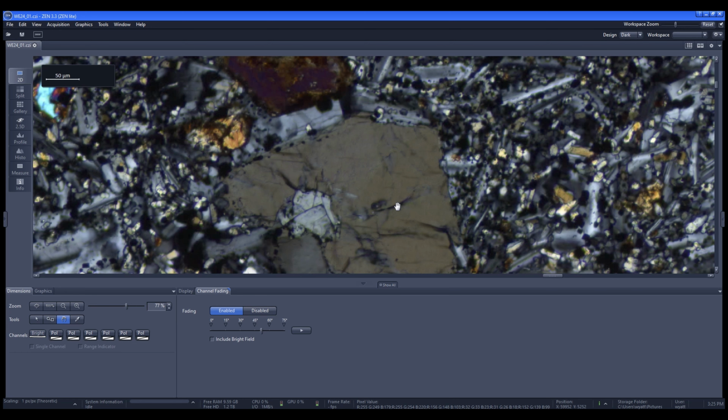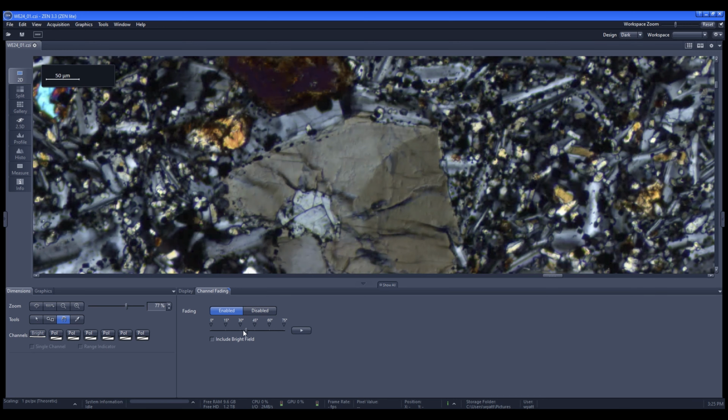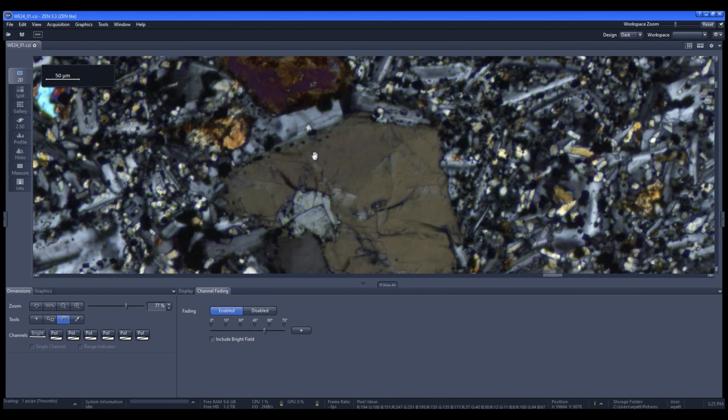Now clinopyroxenes have the opposite. If your clinopyroxene goes fully dark, but the cleavage lines are inclined, so that maybe it's at a roughly 45-degree angle between your two crosshairs, so they're not lined up with your crosshair lines at all, they are inclined to them, that would be a clinopyroxene. So clinopyroxenes have inclined extinction.